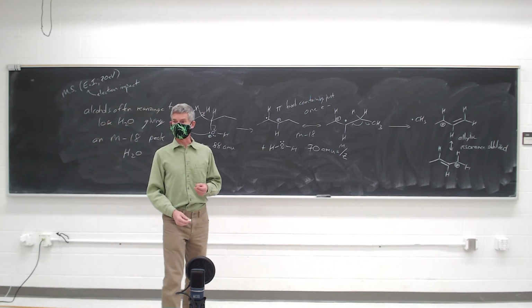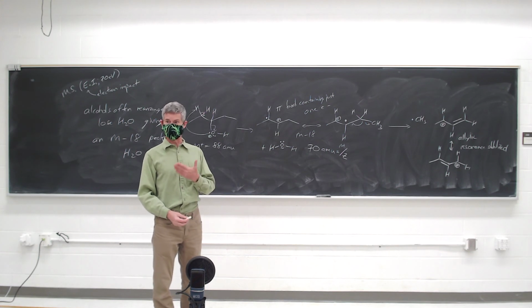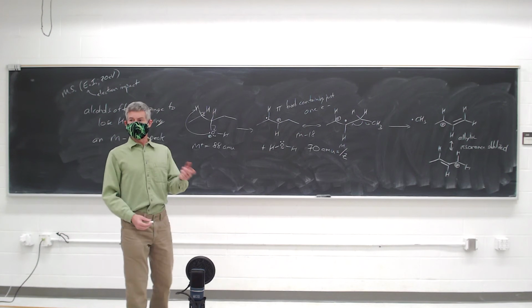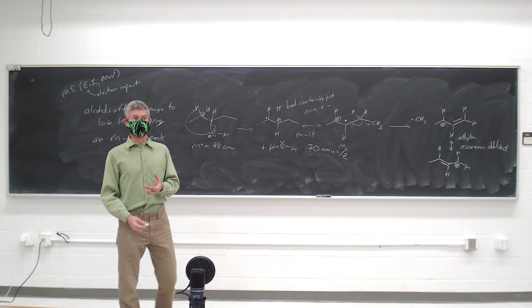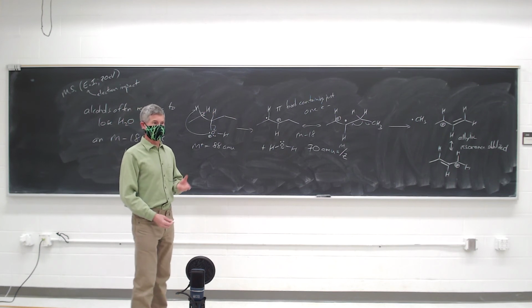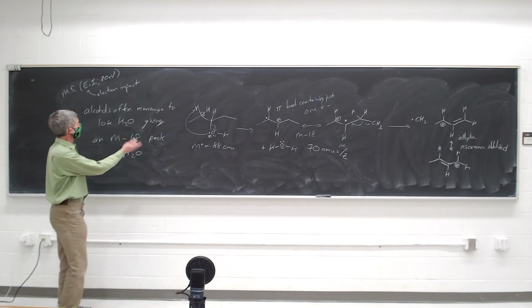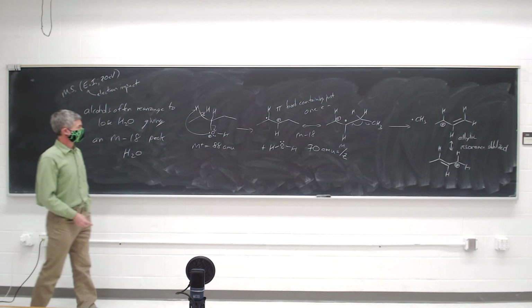Electrospray ionization is very common, for example, in liquid chromatography mass spectrometry, where you're using the HPLC column first and then running it. MALDI combined with a TOF, time of flight detector, is really good for big things like proteins and nucleotides and polymers. Right? But for all the small molecules, usually you'll see EI, electron impact of 70 electron volts.